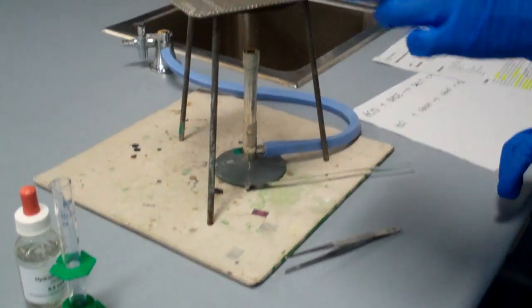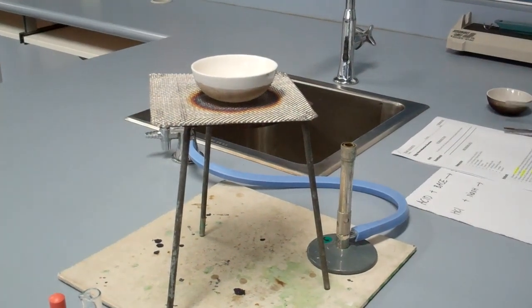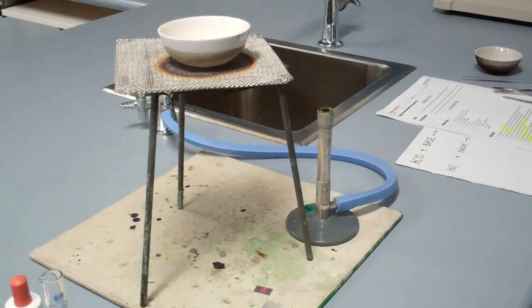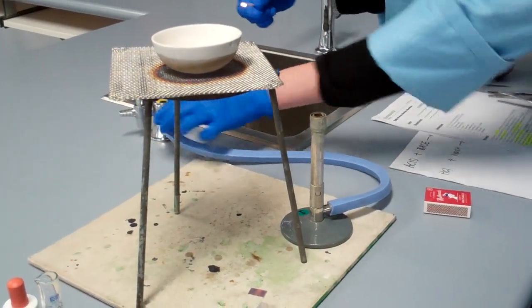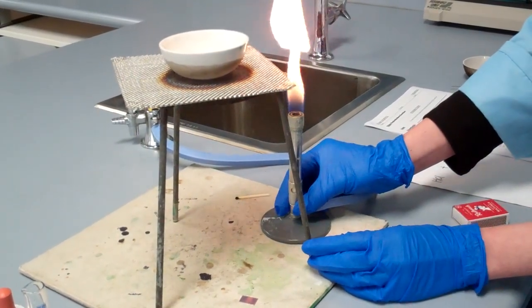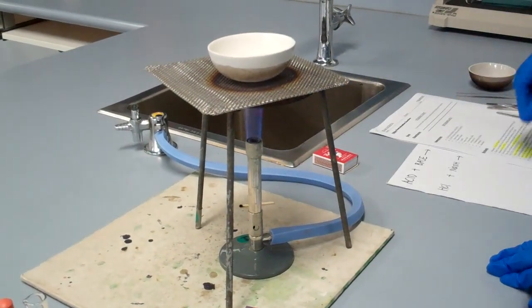So we'll put it on top of your gauze mat, and we will turn the Bunsen burner on. I'll just move the Bunsen burner out so I can see where it is. Remember to close the hole of your Bunsen burner so that you have a safety flame. I'll turn the tap on. Alright, once you have got the safety flame, you can now adjust it to a blue flame by opening the air hole. You put it underneath your evaporating dish, and you need to wait until the solution has evaporated.